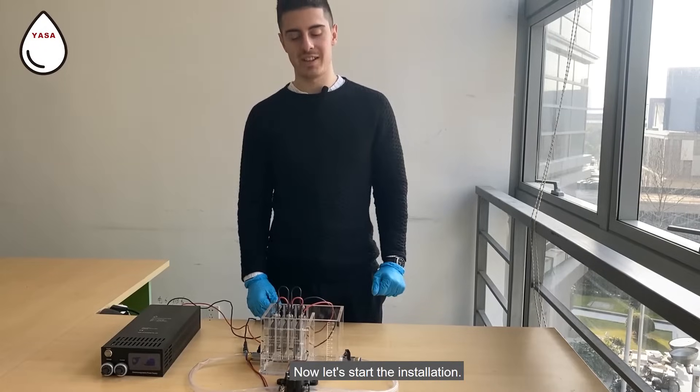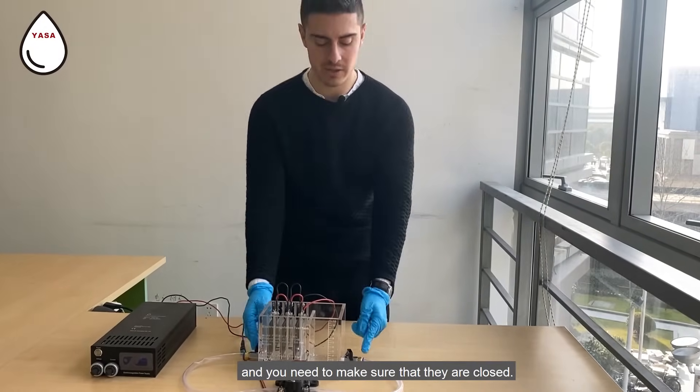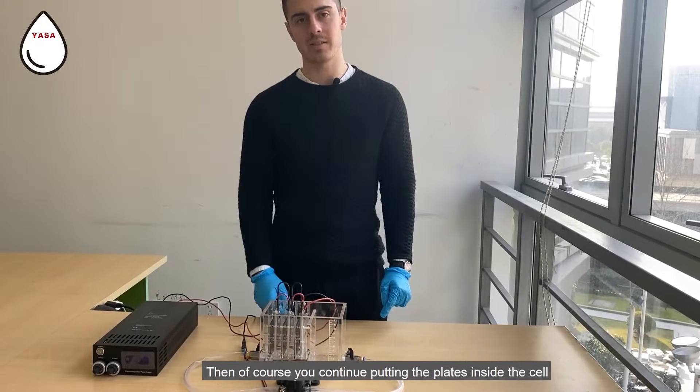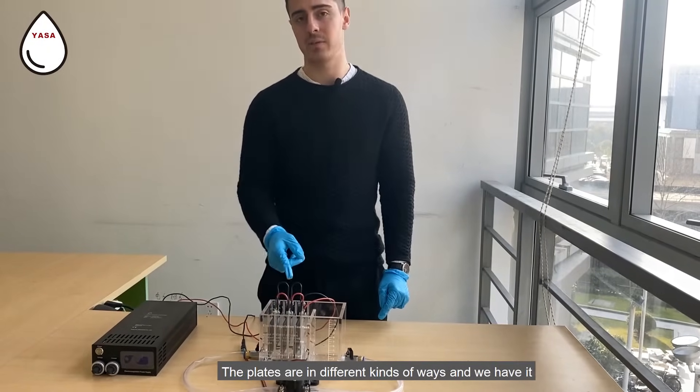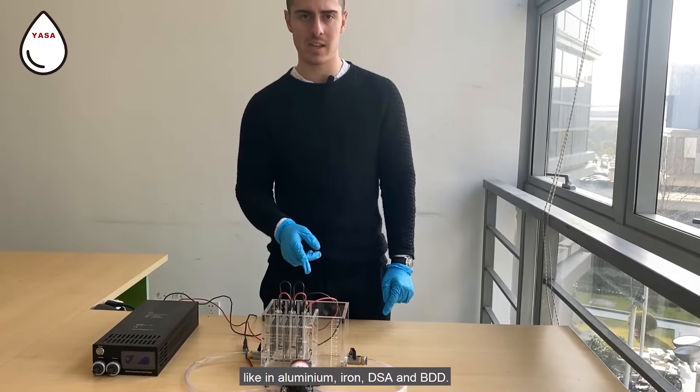Now let's start the installation. You need to put the two bulbs inside the cell and make sure that they are closed. Then you continue putting the plates inside the cell. The plates come in different kinds: aluminum, iron, DSA, and BDD.